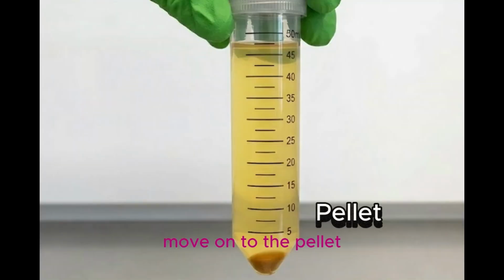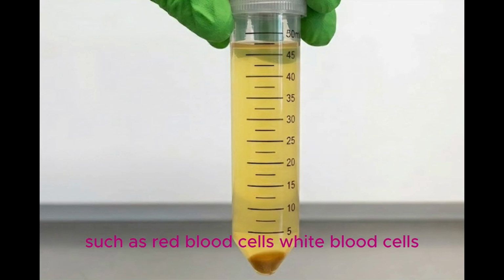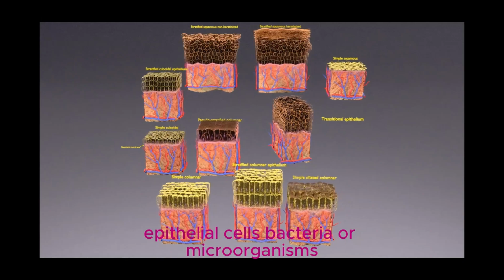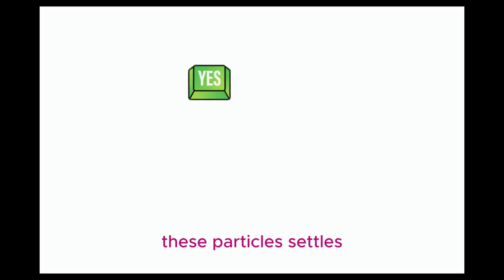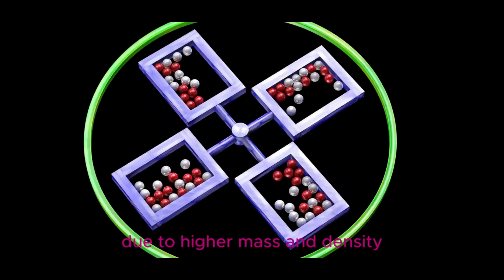Moving on to the pellet, which contains heavier and denser particles such as red blood cells, white blood cells, epithelial cells, bacteria or microorganisms, crystals, and also casts. These particles settle because they experience greater centrifugal force due to higher mass and density.